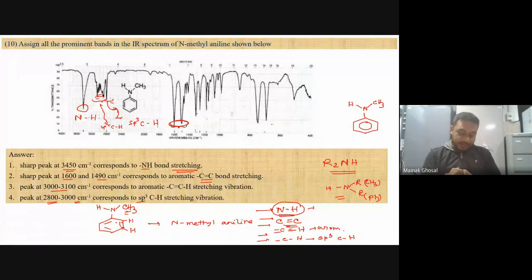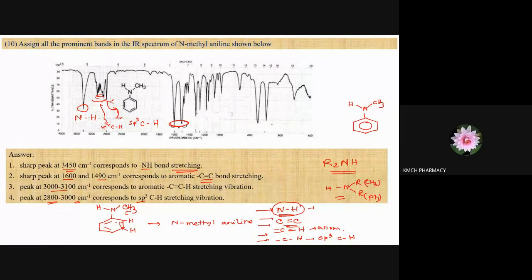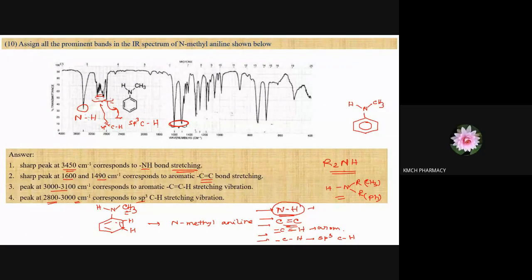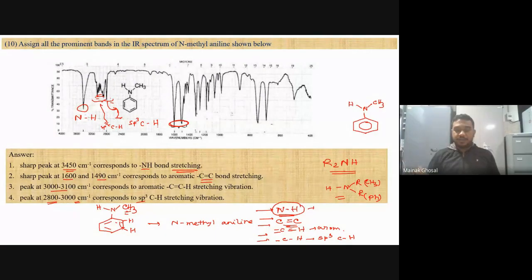Monochromators, yes, whatever you are saying, but if you need to allow a specific wavelength of light, you just use a monochromator. That I need this light, so I use a monochromator, right? One by one, if I want to see which one is changing or which one is not changing, that's why a monochromator is used. It passes not all the lights at the same time, but one by one. The same happens with UV, they pass light one by one and monitor it, right?